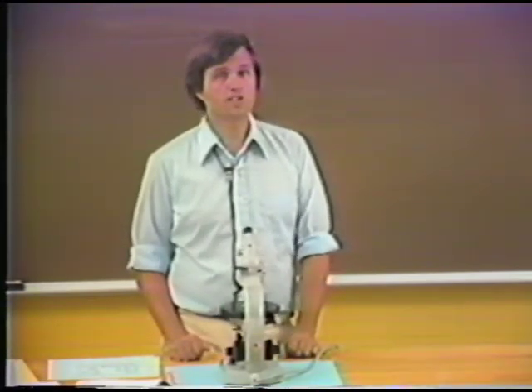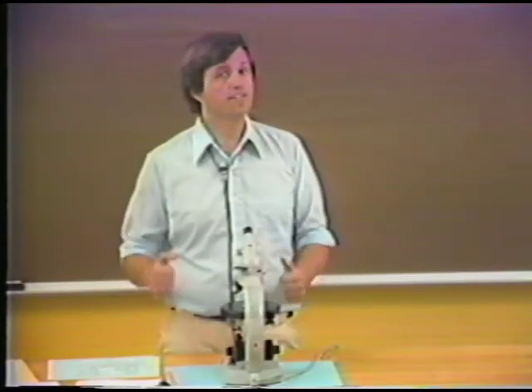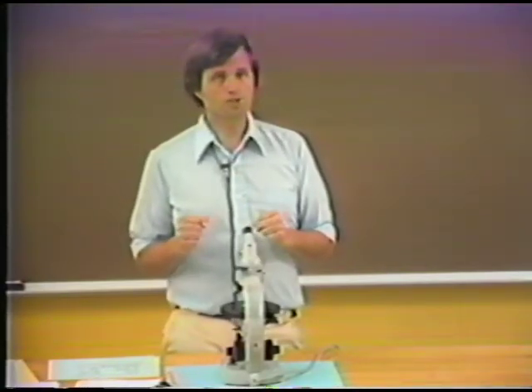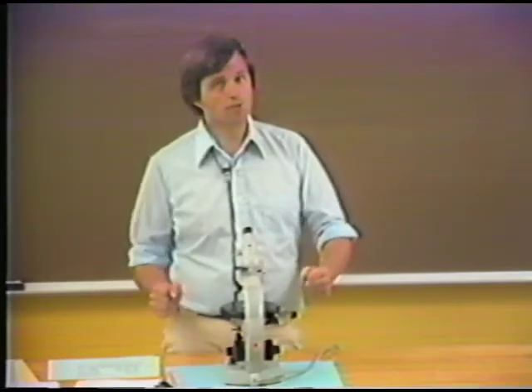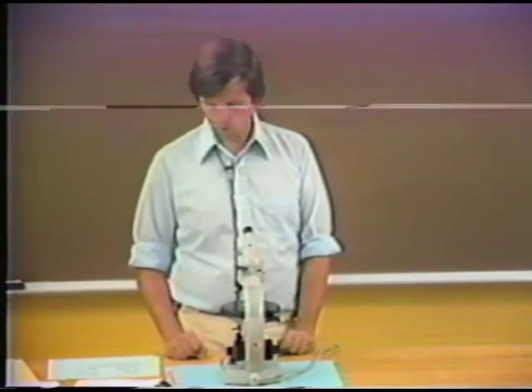The minute we see the isogyres leave from that flash figure, then we know that the position of the E-ray is either in the northwest quadrant or the northeast quadrant, depending on which way they left, and we can then rotate that direction until it's parallel to the microscope polarizer, and then we know that all of the light from the microscope polarizer is being resolved into the E direction. If we rotate it 90 degrees, then we have all the light being resolved into the O direction.